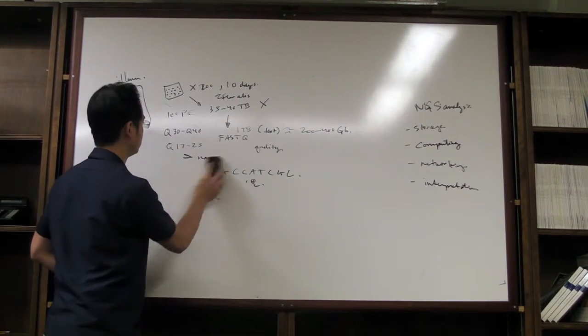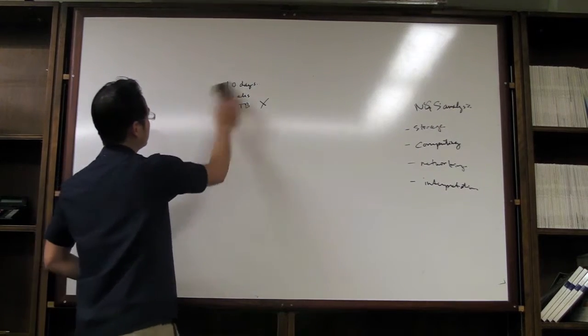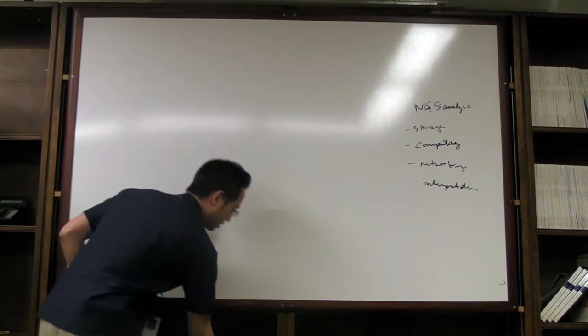So that's FASTQ. So now, yep. Sorry, the higher the score, the better, right? The higher the score, the better. Yep.